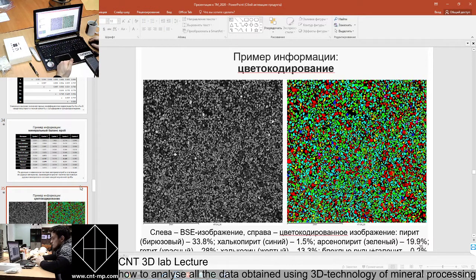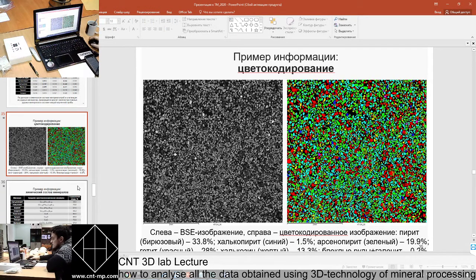Also, we can analyze the balances of minerals during electron microprobe analysis and during making electron microphotos, using characteristic X-ray reactions of mineral phases with the electron beam.